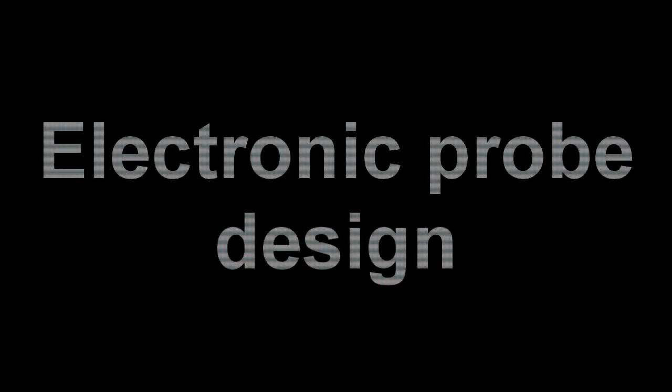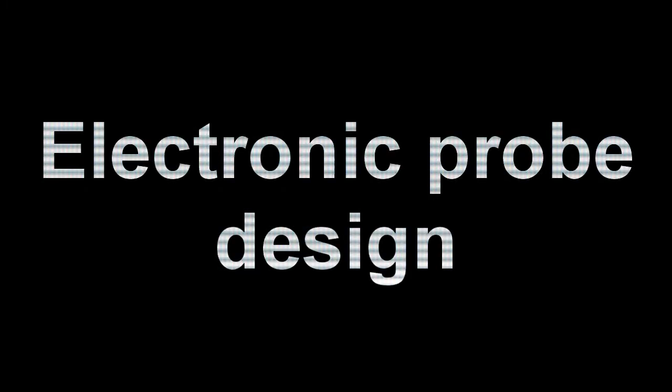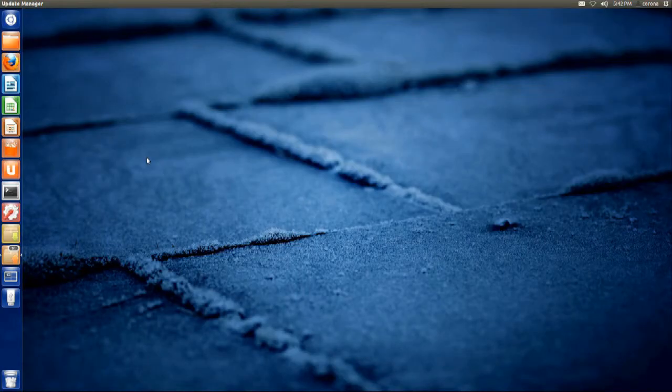Hey guys, this is John Tripp, and I'm going to show you how we design electronic probes used in the eDNA project. So one of the first things you'll want to do is go ahead and start your computer in Linux. And then once you get to Linux, you'll want to go to your home folder.